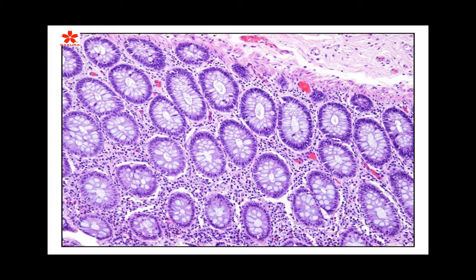And the reason why I'm saying this is because the pathologist should never have to come back to us and tell us that something's going wrong with the stain. We're the scientists, and we should be able to see this before we even take the slides out to them. I am assuming that everyone does some kind of spot check, some kind of QA check with the first slides that go through. Some of you use a control slide. But we should be able to identify if there's something going on with the stain before we take it out to the pathologist.